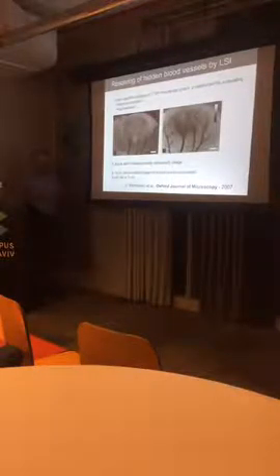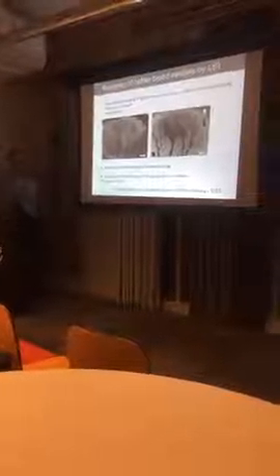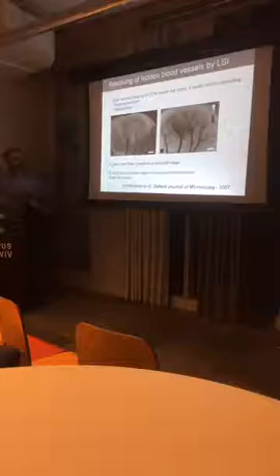Here it's maybe much more clear. So we use laser speckle and compare it with standard microscopy, because if we use standard microscopy to visualize blood vessels, sometimes, and this is a tumor, we don't see what is inside. In order to visualize it, we can use very expensive, very advanced techniques, but most of those techniques take a very small area.